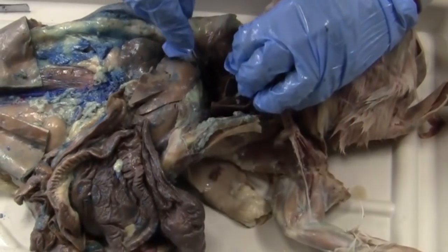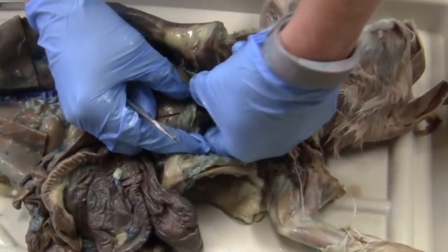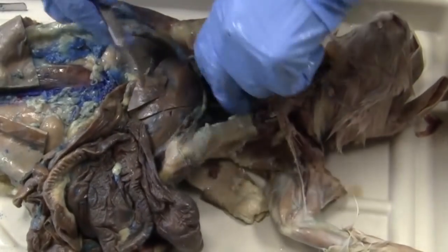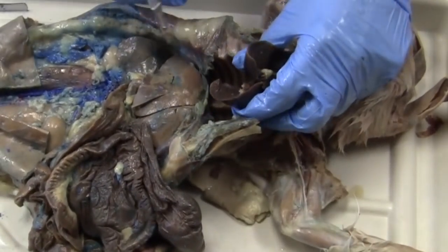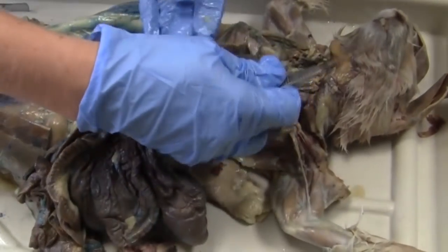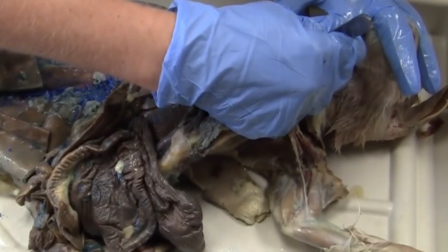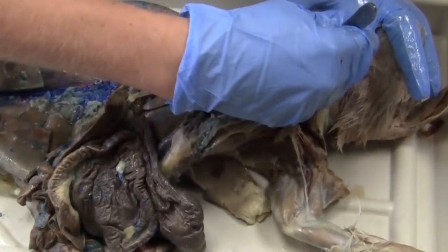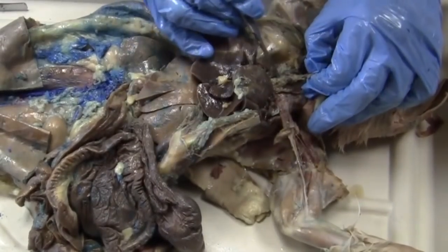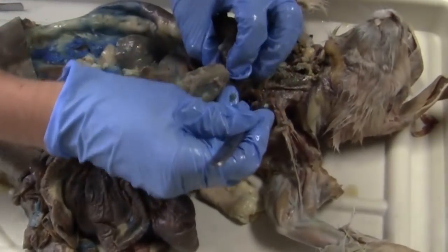So I'm going to come down here, I'm going to find the caudal vena cava and the aorta, cut those. Perfect, got the bottom half of my heart and lungs cut out. I'm going to do the same thing on the top of the heart. And what I want to do is try to cut as many of these arteries and veins as I can up here to keep them onto my heart, which some of them have kind of already come off anyways.